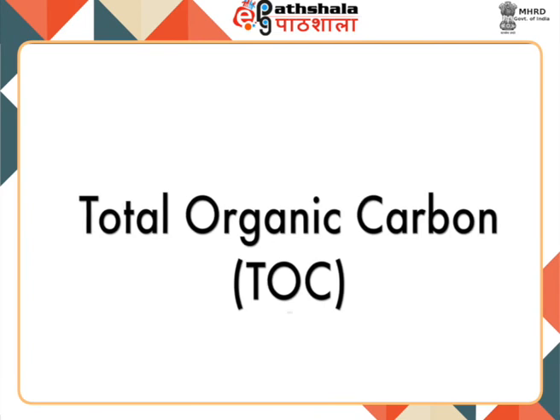Next, total organic carbon. This is the best method for the measurement of total organic matter in water samples. The TOC test uses heat, ultraviolet light and a strong chemical oxidant, or a combination of these three, to oxidize the organic compounds to CO2 and water.